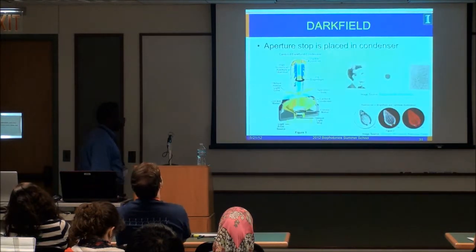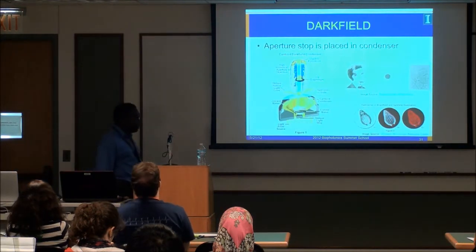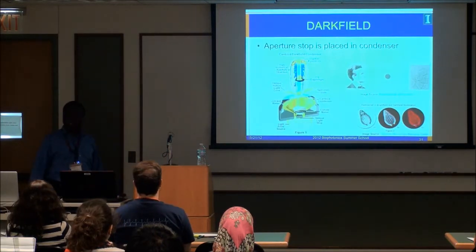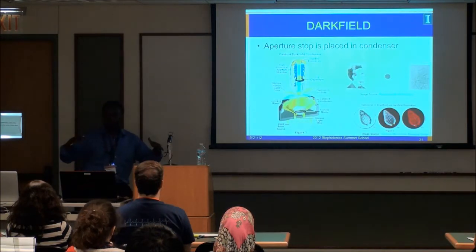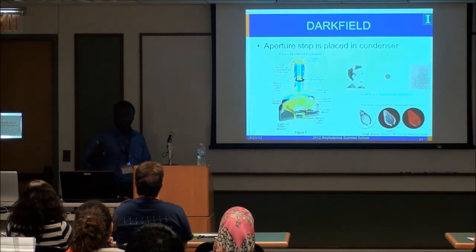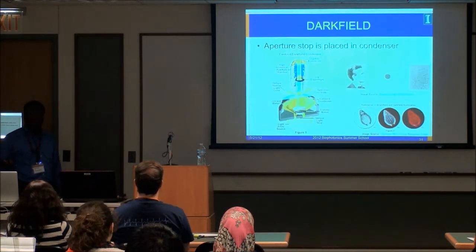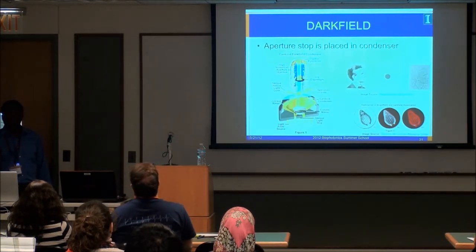Dark field is one of the more clever things I've seen people come up with. You can ask yourself the question, why can you see stars? Stars which are technically other galaxies. Because most of the sky at night is black, controlling for light pollution in the city, the contrast is so high you can boost your sensitivity to objects that are really far and small. People who do far field nano imaging actually take advantage of the dark field technique. It's actually a high spatial frequency filter when you think about it.